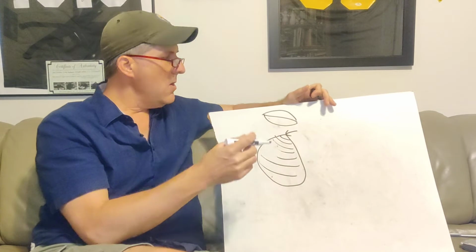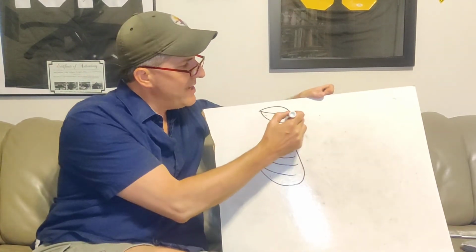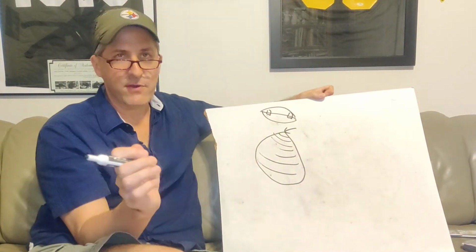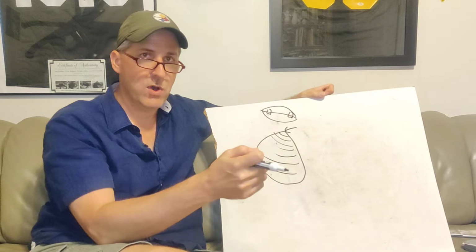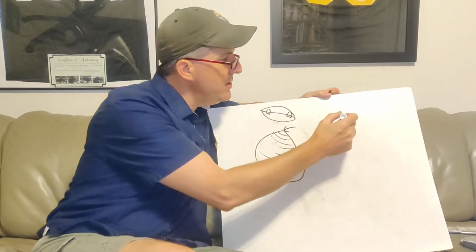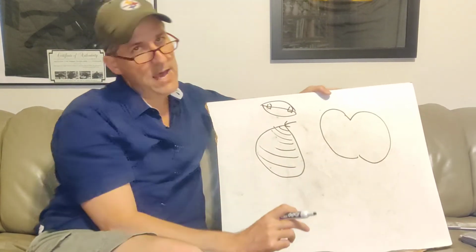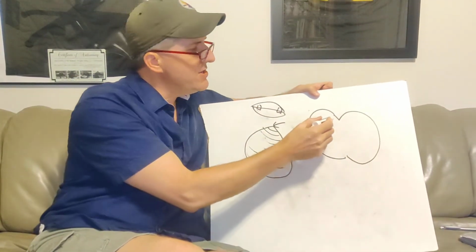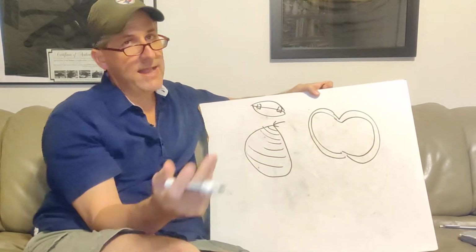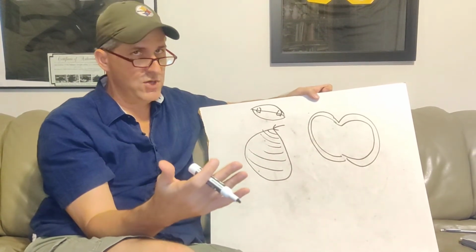Now, whenever you take a clam and you shuck it, you hold it, there's going to be 2 adductor muscles. Adductor means to close. That's when you would take your shuck knife or your scalpel and stick it in and cut each one. Failure to do so means the clam's not open, and you crack it open. When you do that, the clam would have 2 valves, a left and a right half. Directly on the underside of the shell is going to be a thin membrane on both sides. That's the mantle. It secretes the calcium carbonate to make the shell.